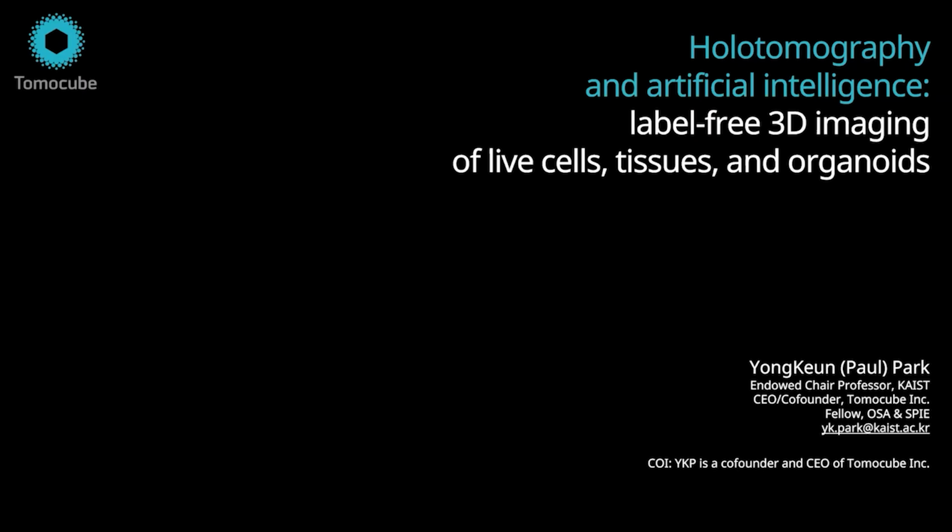My name is YongKeun, and I'd like to talk about holotomography systems, the principle and application, and how it can be used for phenotypic drug screening. So to make a long story short, holotomography, or HT, is an optical technique to visualize the three-dimensional shape of the cell with high resolution without introducing any exogenous labeling agent.